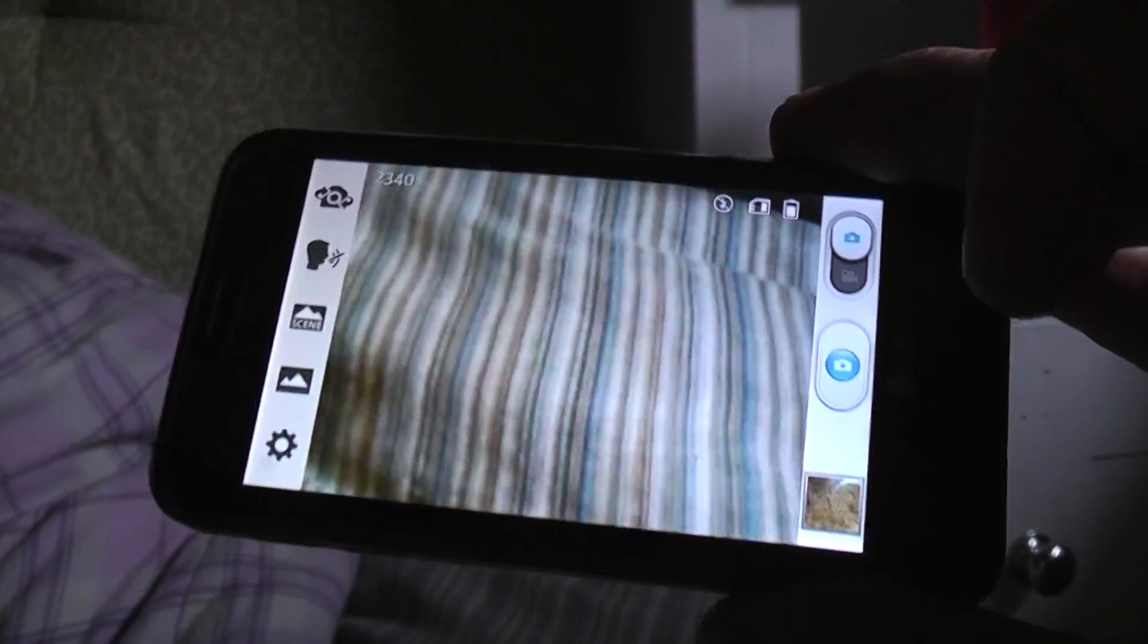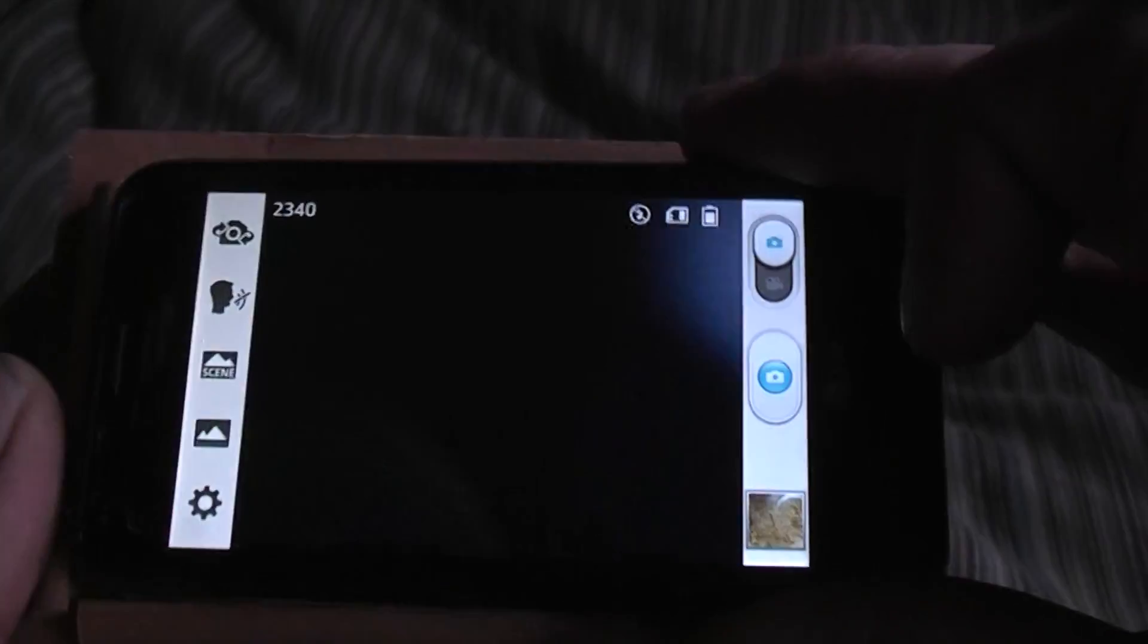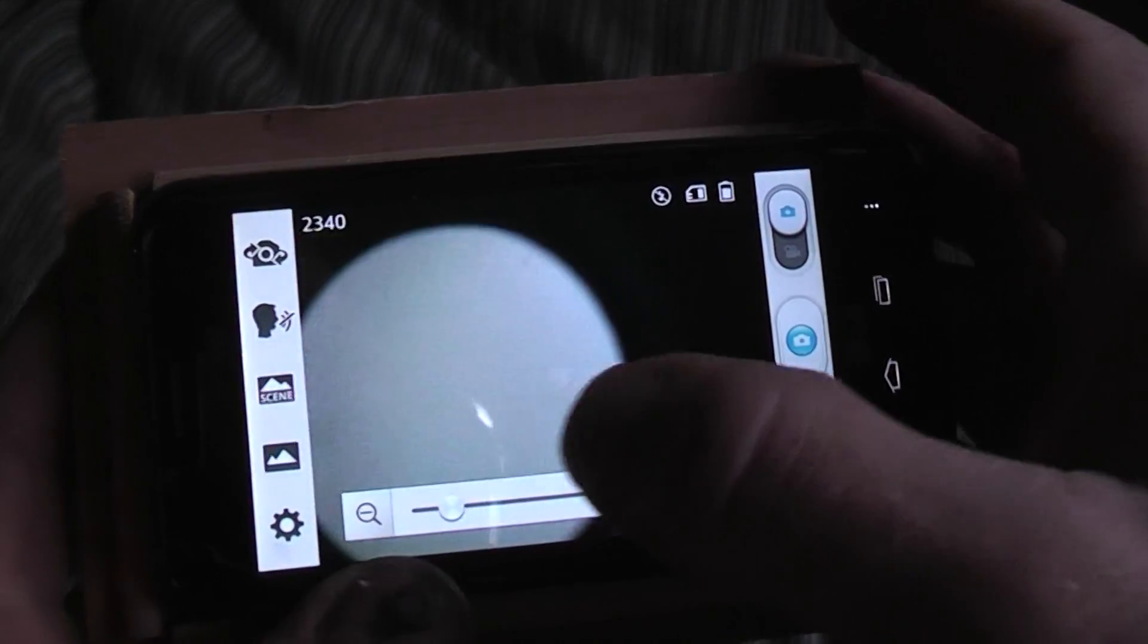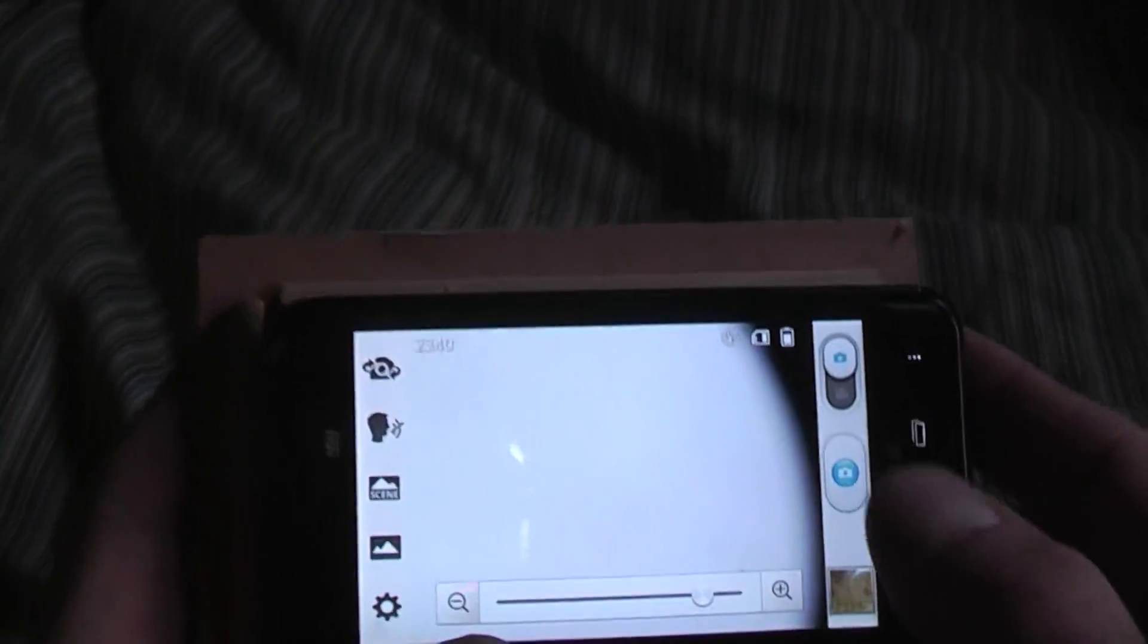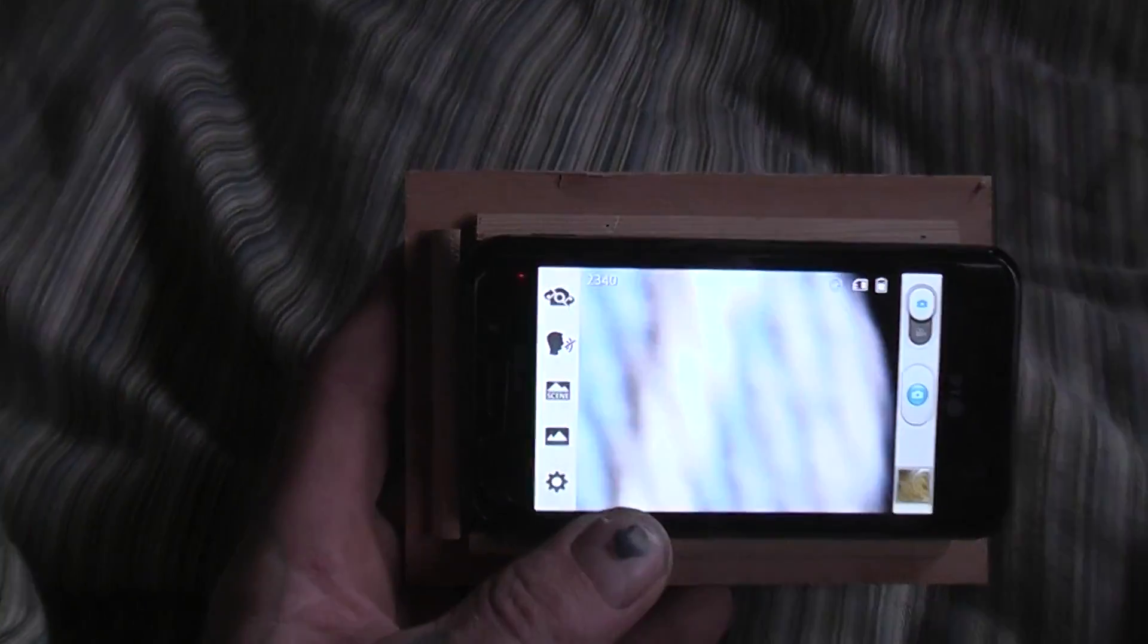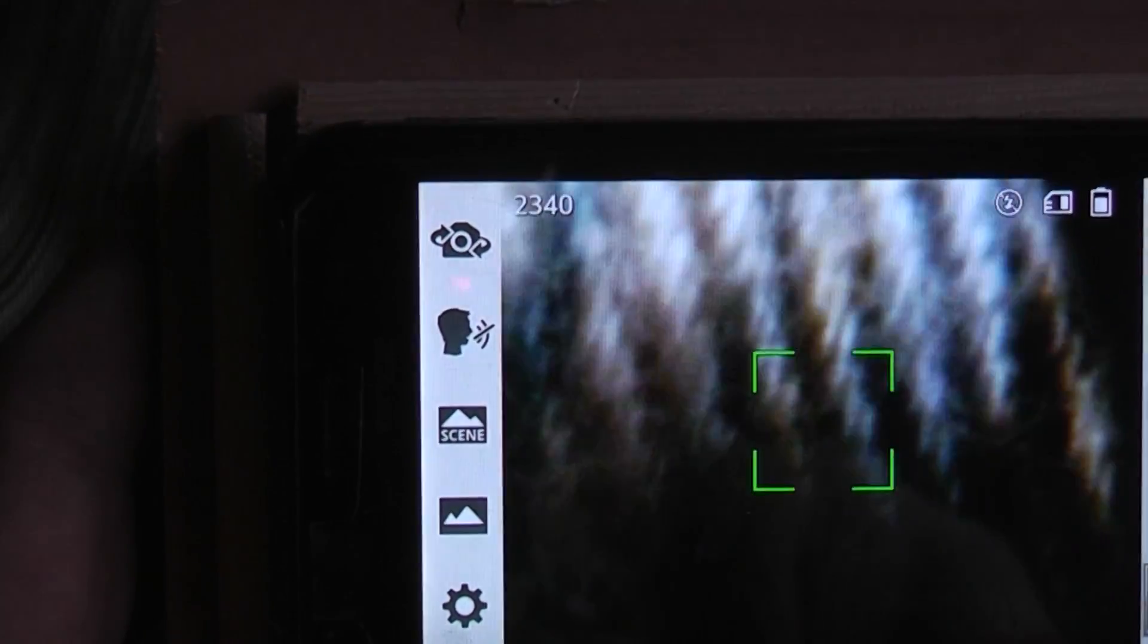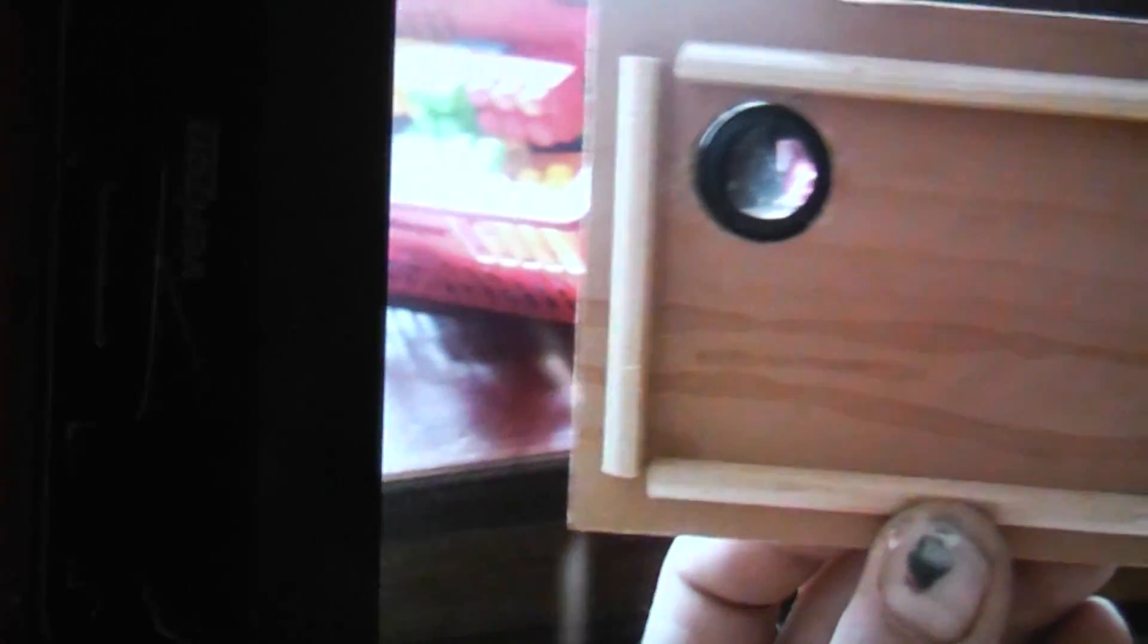So I've got my camera set right, just regular pictures, mounted in here. You can actually see that if it's on the small setting... So I focus way in. Take this thing down here. Check this out. You can get way in there. I'll try to show you a couple pictures I took. This is a close up of my skin, television screen, there's my desk, there's some Indian corn.